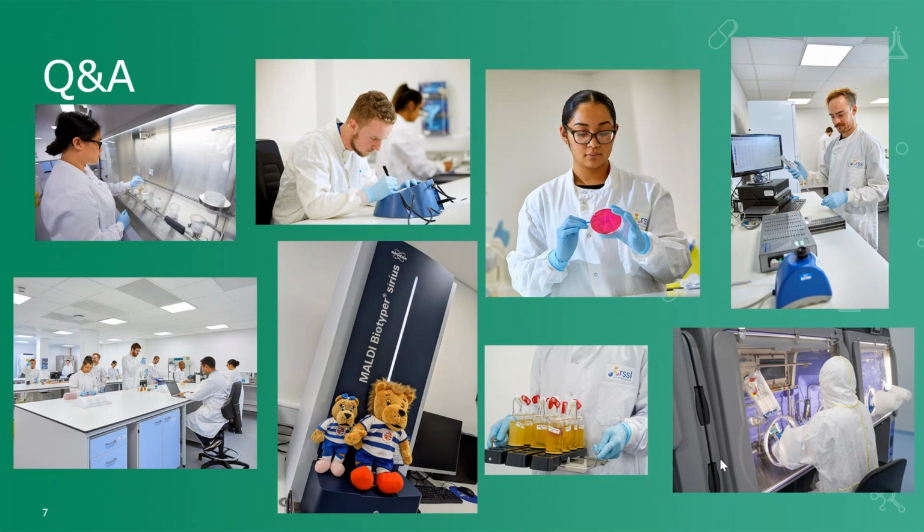Yeah, so there is leeway if it can be shown that the products have a natural level of particulates, as they might do with cell matter or whatever matrices are used, and provided you can get good visual representations of that, you can understand what consistency looks like, whatever normal can be established at.